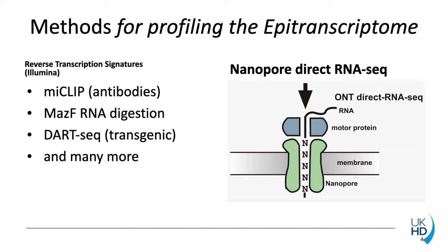So typically, the pore extends over 5 consecutive residues on the RNA molecule, meaning any changes that occur within this 5-mer while the molecule is passing through the pore can be measured by the device and then can be turned into base calls by the company's software, for example.